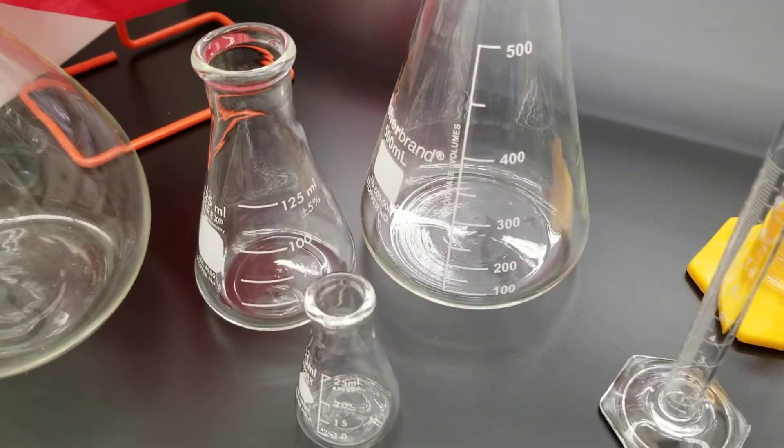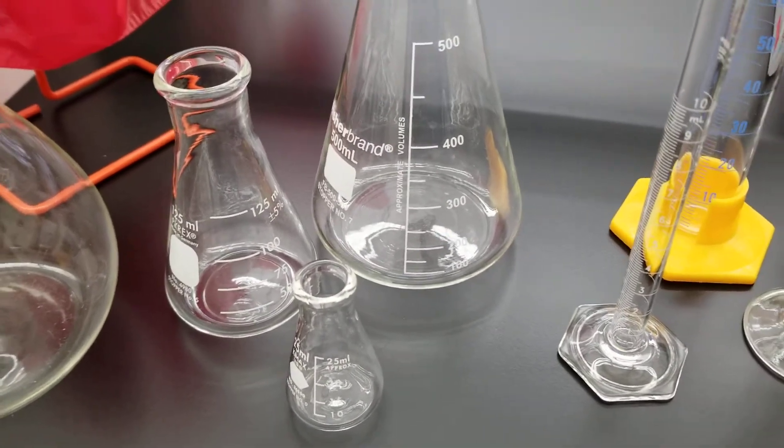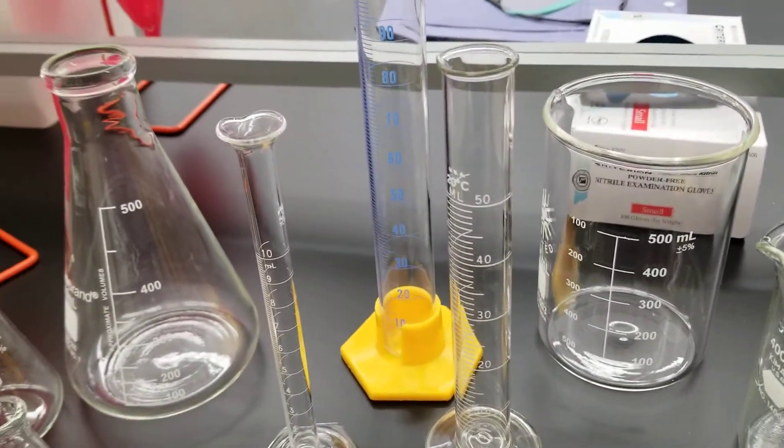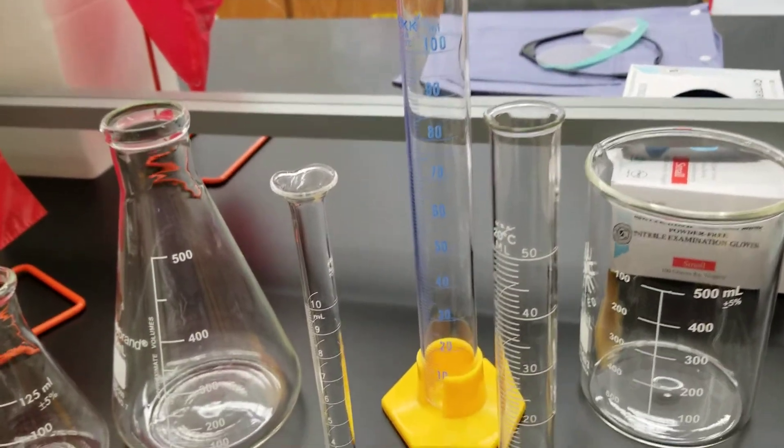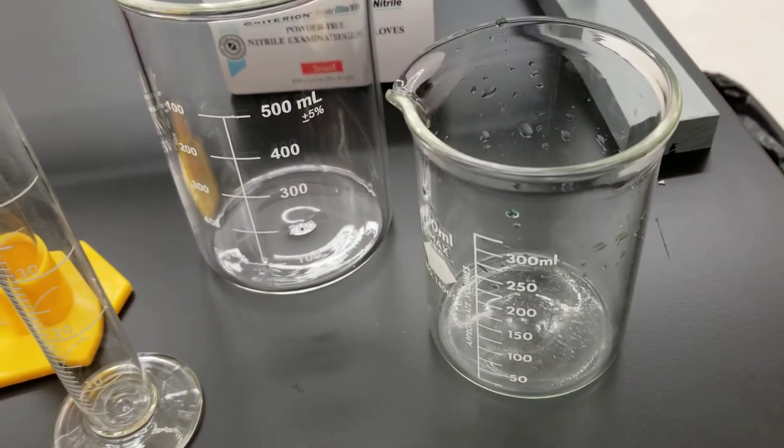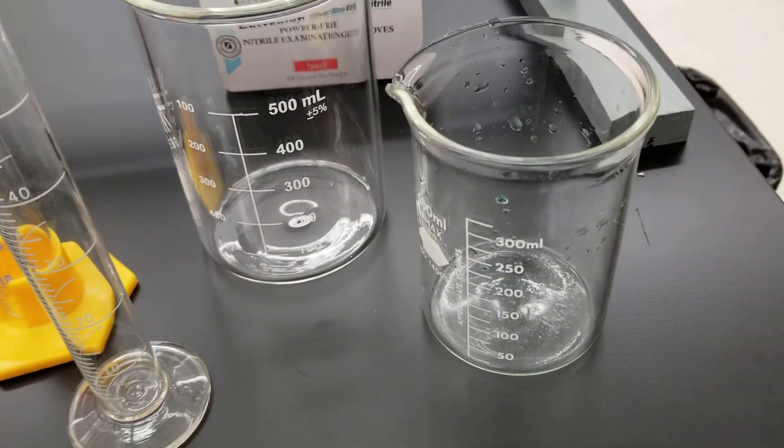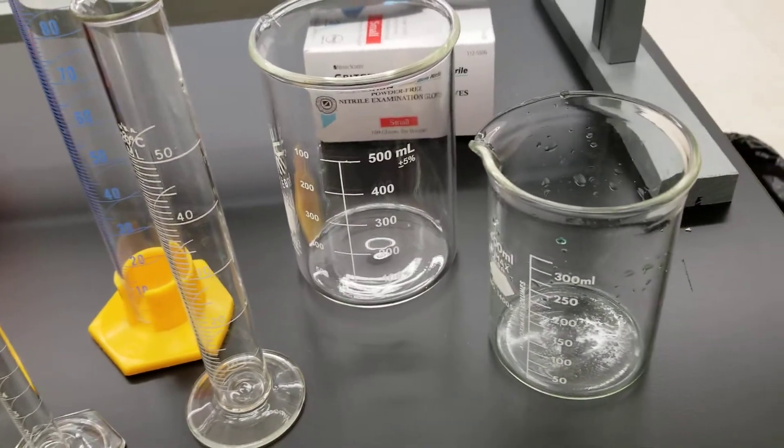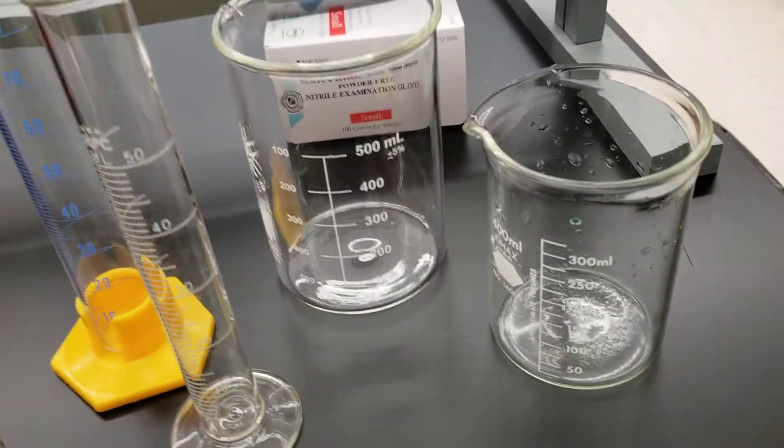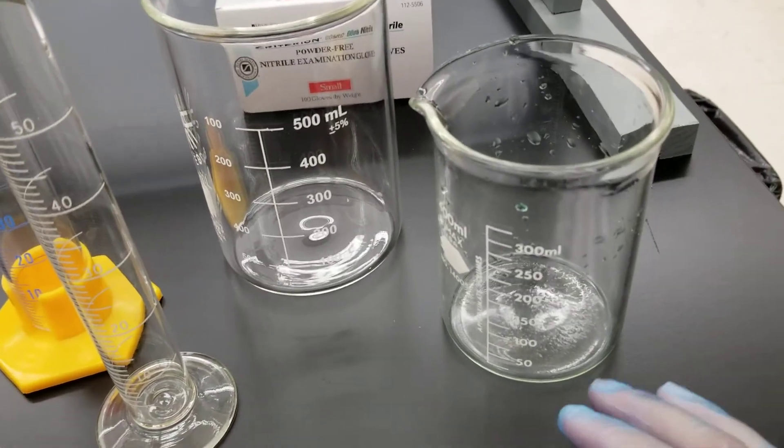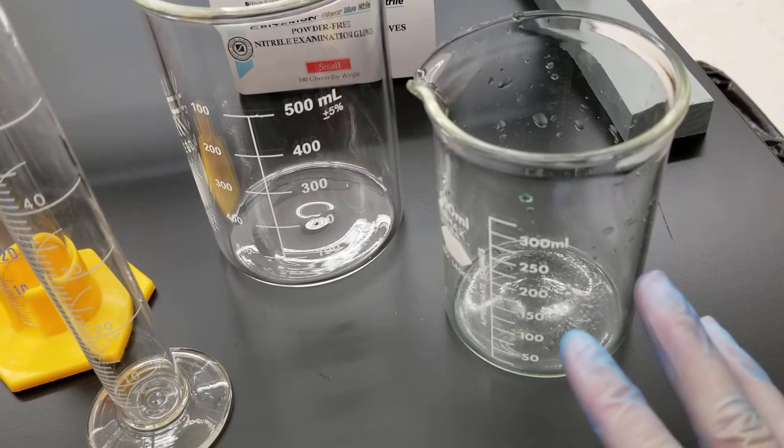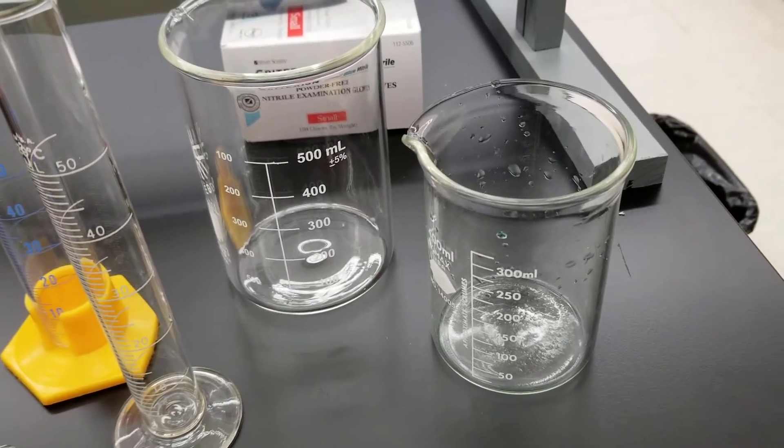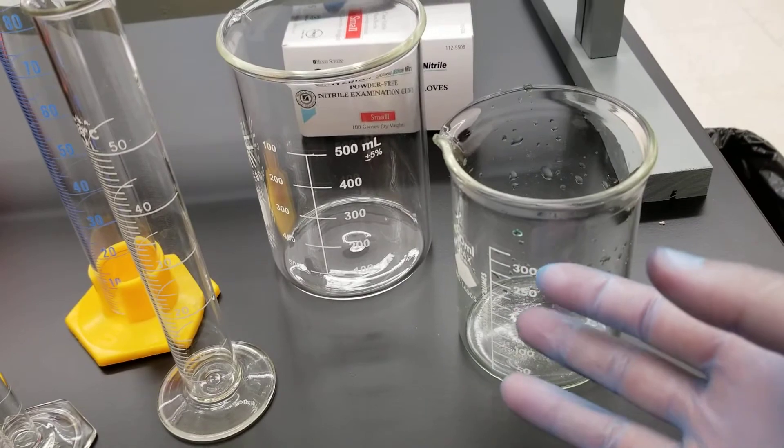So this is an Erlenmeyer flask. These are Erlenmeyer flasks, and we have ranging varieties there of the amount of volume. These are graduated cylinders here in the middle. We have a variety of volumes there, and these are two beakers. This one I've been using in some videos, that's why it's got some green water in there. These are not very accurate, and you wouldn't really use them for anything other than holding something that you might be taking from. So like I did with the green water, you could put something that you're going to need to take from making accurate measurements using maybe a pipette. You could just store a large amount of fluid in there for that.